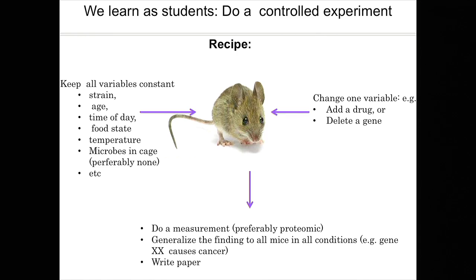And then we do some measurements, and this is the experiment. You basically take an invariant system, we introduce one change, and then we do measurements. In our case, these are preferably proteomic measurements, and then we make some finding.